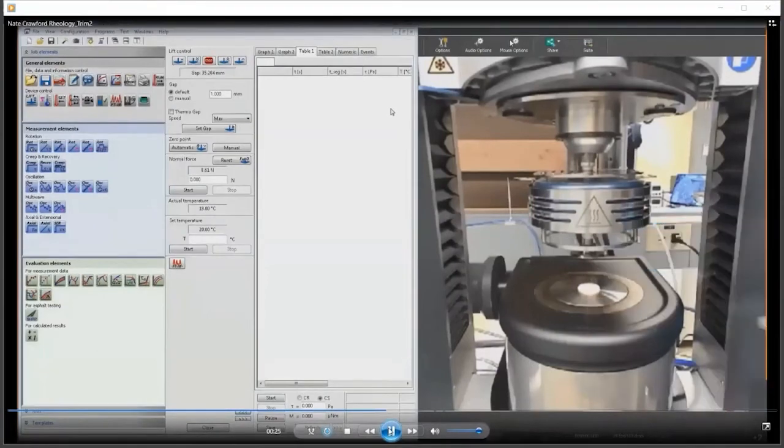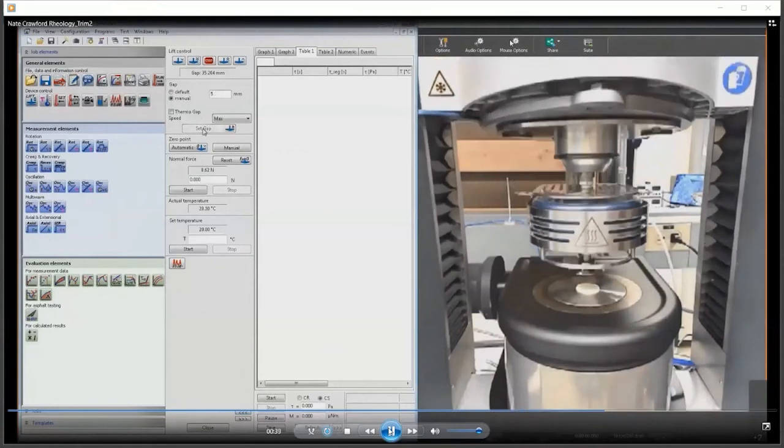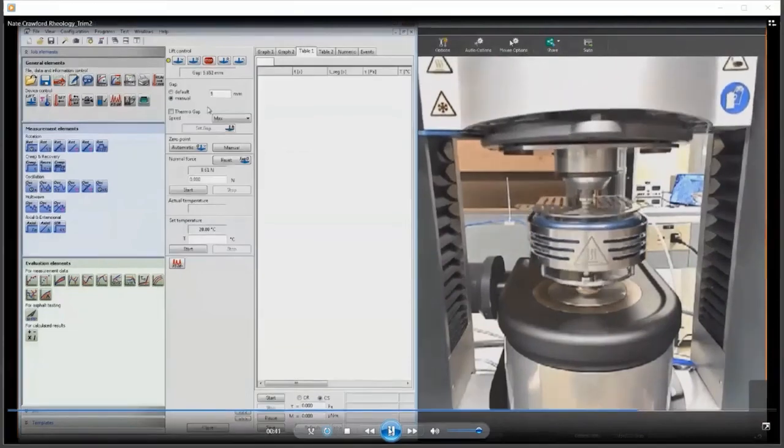So what we are doing is simultaneous collection of the rheological properties as well as the changes in the FTIR peaks using the FTIR by itself. The temperatures are controlled right on the pedestal when the plates make contact.